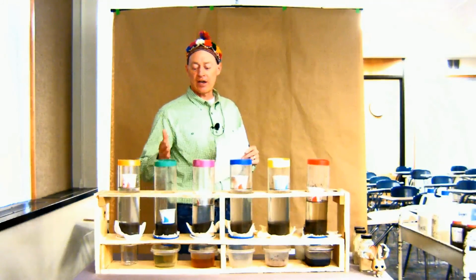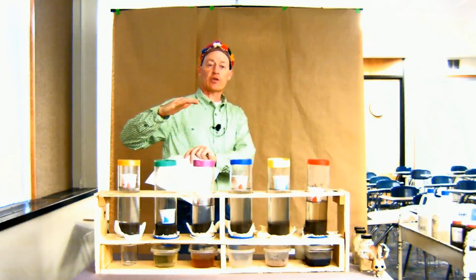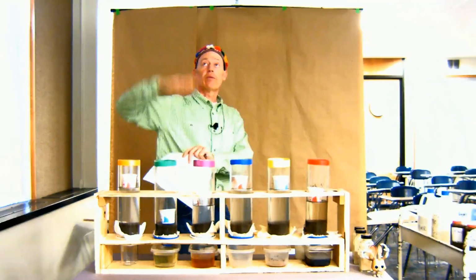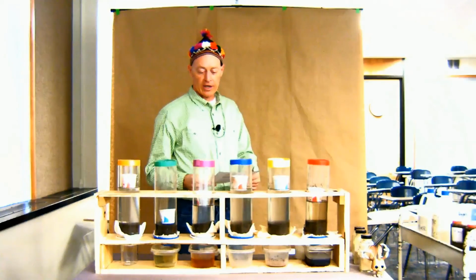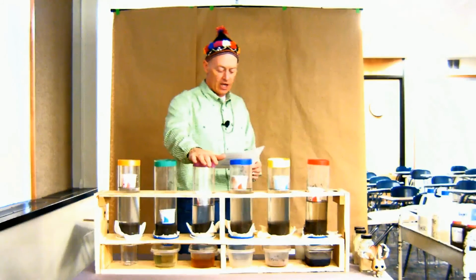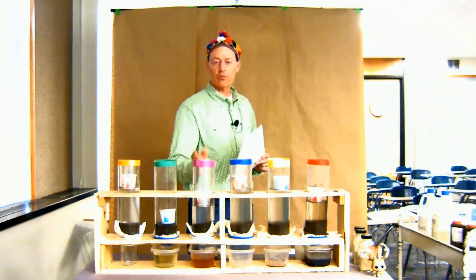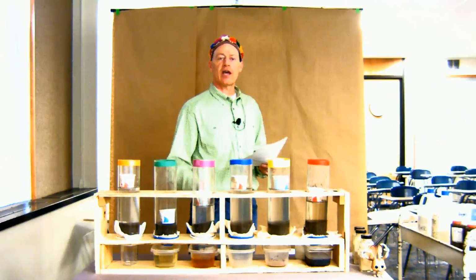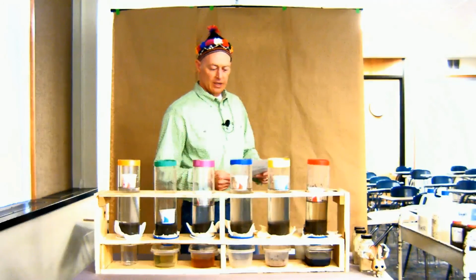Oftentimes, we can't add even that much water in a field situation because we don't have that much water, and we don't hardly get that much rainfall, and a lot of it is evaporating as we apply it. Okay, so this is the flue gas gypsum with the powder. It's going to move through pretty good. By the end of the day, it's probably going to be moved through. Then you're going to have basically calcium on those exchange sites and sodium being off those exchange sites.